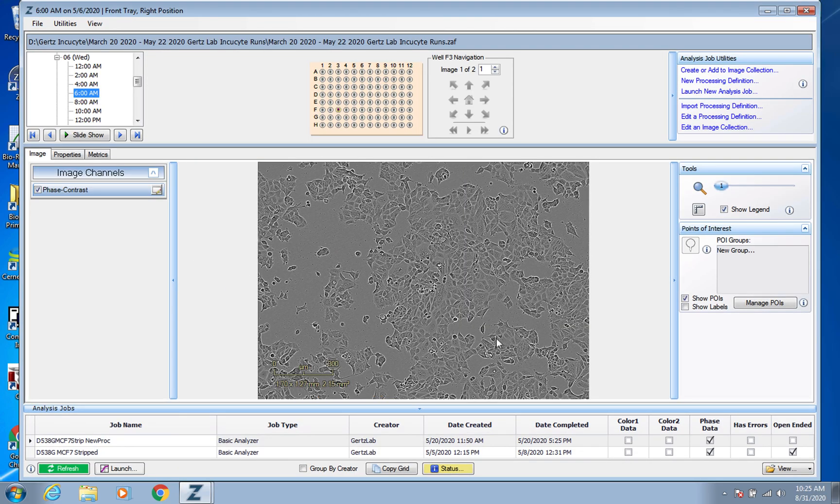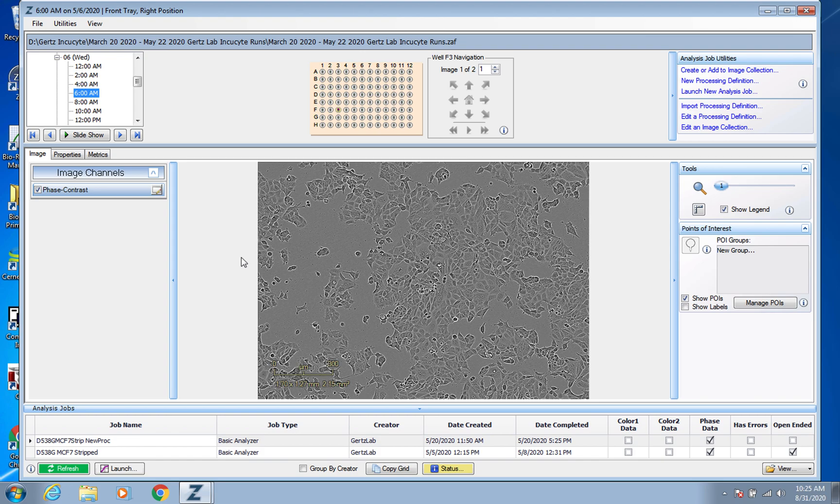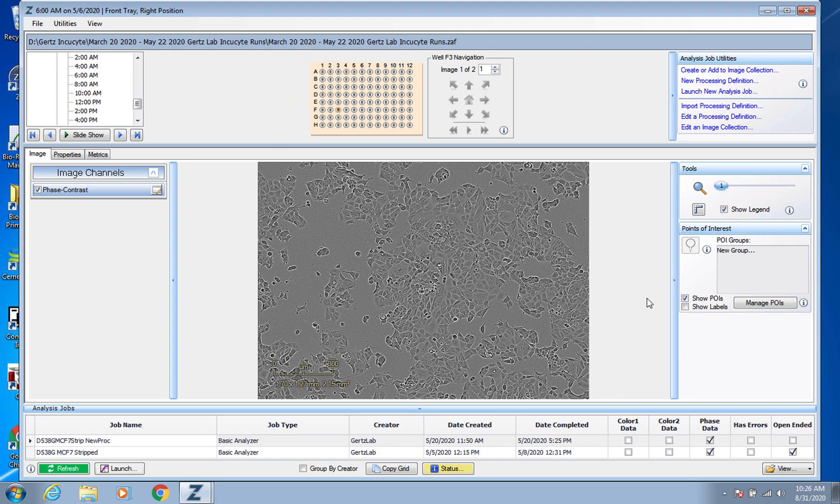So no, I'm not actually going to save this one. You know, and so then. And you can always go back. Edit a previous processing definition. Edit, you know, old image collections to use for this. So just keep that in mind. All of those are available. And another thing, one last thing, sorry. To do is, once you've created a processing definition you're happy with. It might be worth testing it out just on a few wells. You know, over a smaller time set. Just to test it out. See if that data looks good. Before running it across everything. And waiting, you know, the two to three hours it can take. For it to run across everything. That's something I kind of like to do. To make sure that this processing definition is likely going to work for the whole plate.